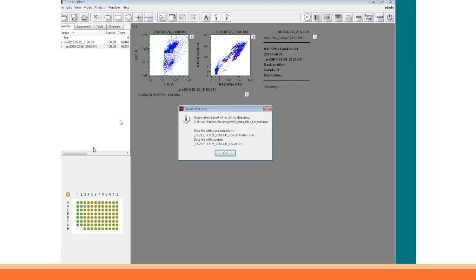So, and here we have the information window of our successfully exported results. So here we see the directory where my sample data file is saved, and also my exported results are saved down here. And as soon as I click the OK button, the individual analysis pages for each sample position in this group data file are created.